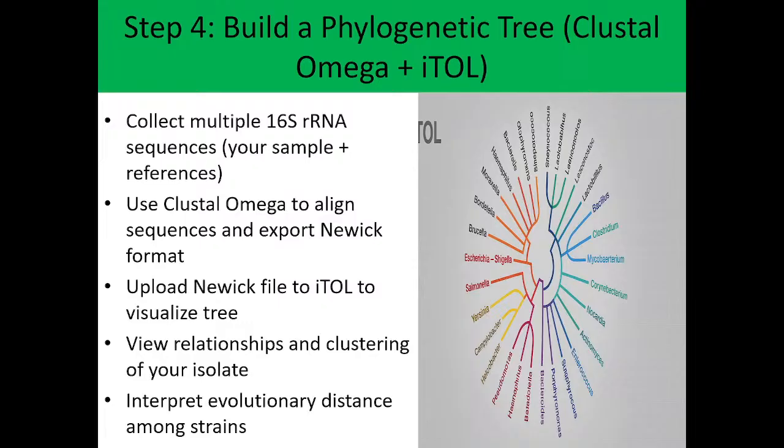You also see Salmonella. And the other ones, in the other colors, those that are far apart, if you look at the branch of E. coli, Escherichia coli, and Shigella, you will see that they are farther apart.